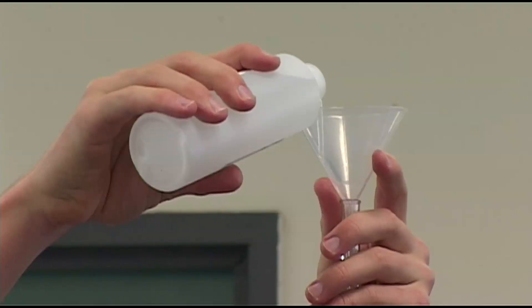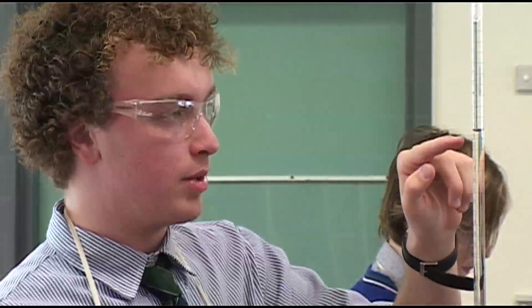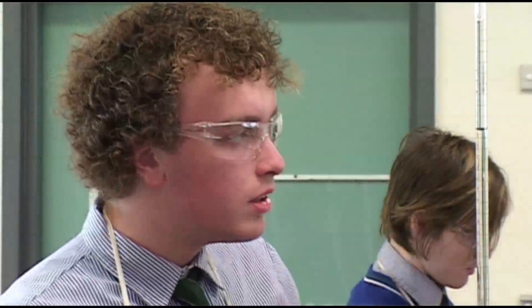We're given an acid of an unknown concentration, and we have to titrate it — which is adding a known amount of a base — and when the acid is neutralised we can work out the concentration of it, because we have three knowns and one unknown.